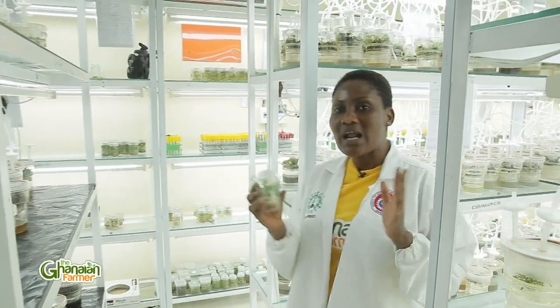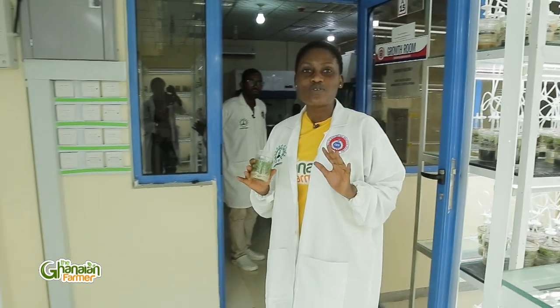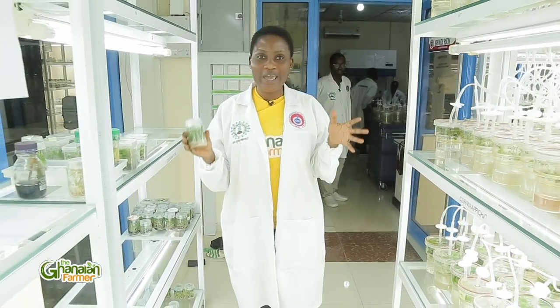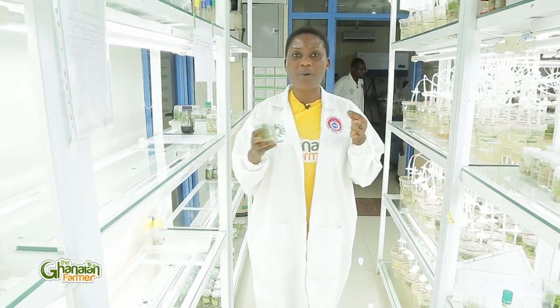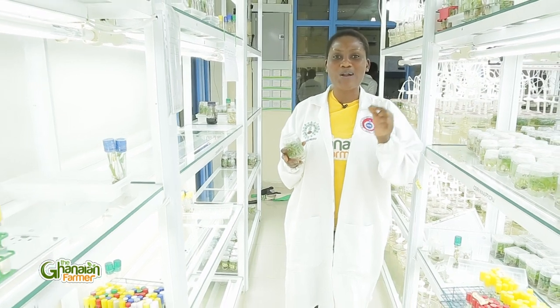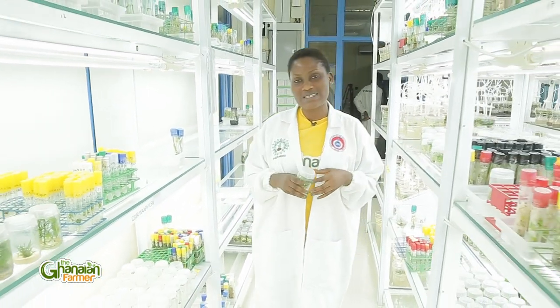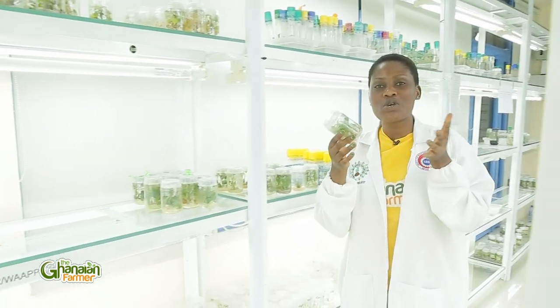We found ourselves in one of their departments, which is the tissue culturing section, where they produce clean planting materials for tuber and root farmers. Here we have tubers such as yam, cassava, pineapple, sweet potato, and also plantain. But our focus today is going to be on sweet potato.